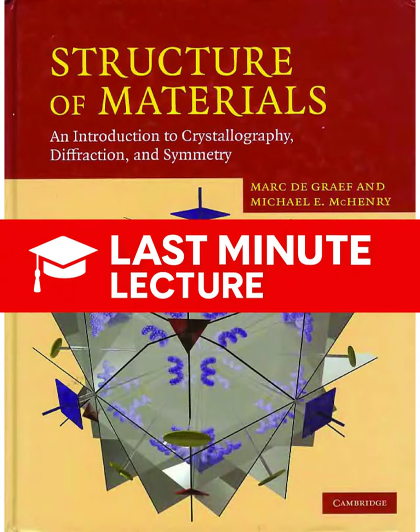We've covered extensive ground in this deep dive into the geometry of X-ray diffraction. We certainly have. We started by understanding the generation of X-rays via accelerated electrons, producing both the Bremsstrahlung noise and those precise characteristic peaks we need. Then we learned how the K absorption edge is strategically used in filtering to select a pure monochromatic beam. And from there, we established the geometry of wave interference, which leads directly to Bragg's law, 2d sin theta = n lambda. That law links the internal atomic spacing of the material to the measurable external angle of the diffracted beam.